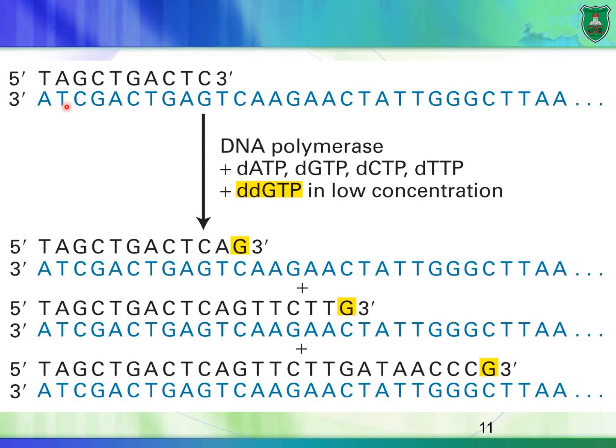So I have to have some knowledge of the DNA sequence, or the DNA fragment that I want to sequence, that I want to determine what its sequence is. Okay? And the last thing I need is a dideoxynucleotide. Okay, so I'll have 4 different reactions.